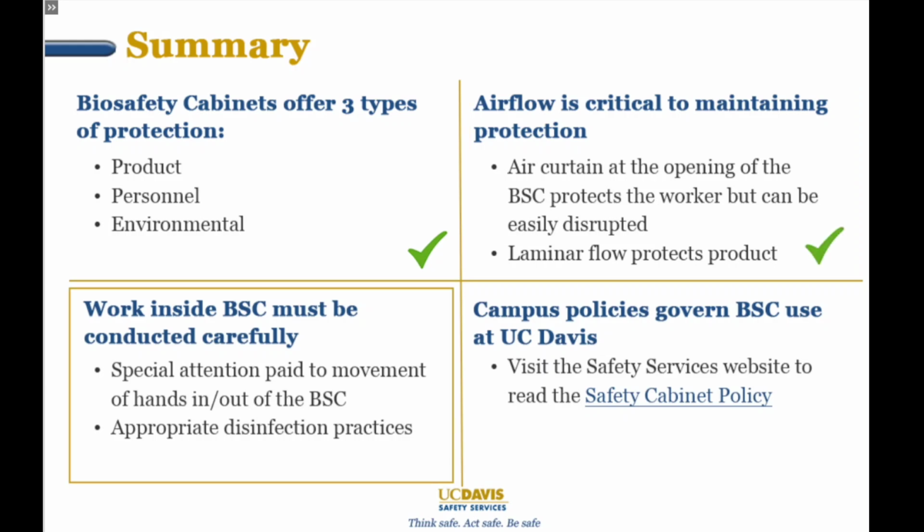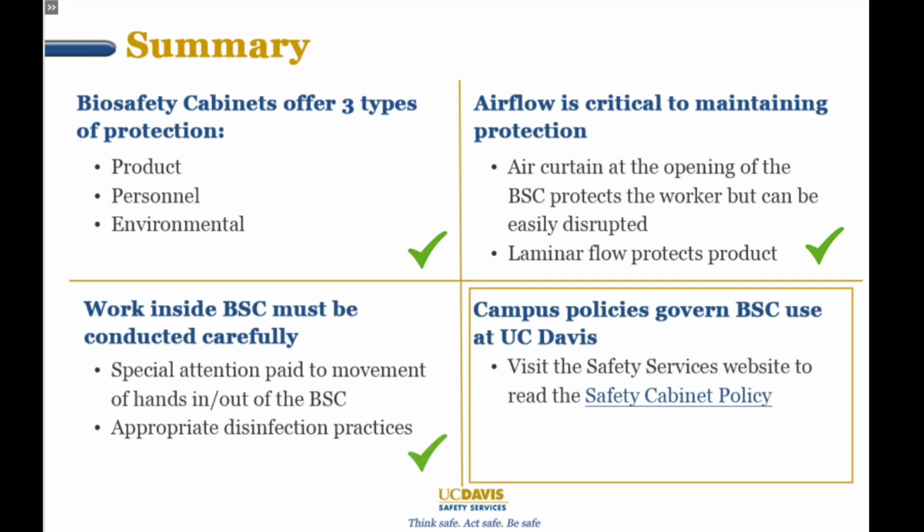In addition, to preserve this protection, work must be conducted carefully within the BSC, with special attention paid to movement of hands within the cabinet as well as into and out of it. You must also employ thorough and appropriate disinfection practices. Finally, a number of campus policies govern BSC use at UC Davis. To review those policies, please visit the link at the bottom of this page.